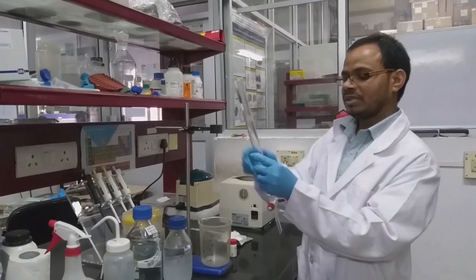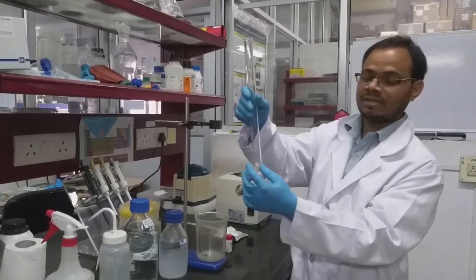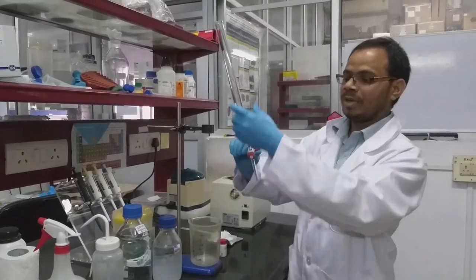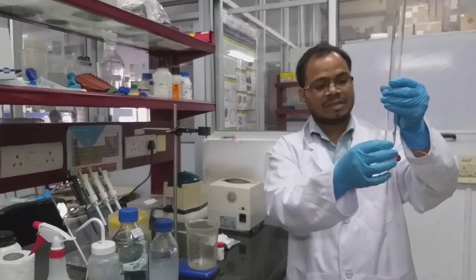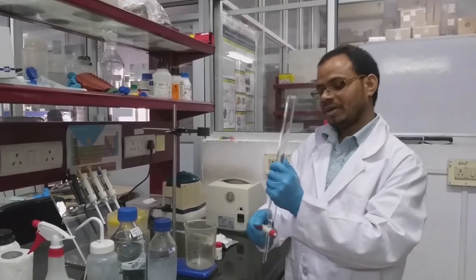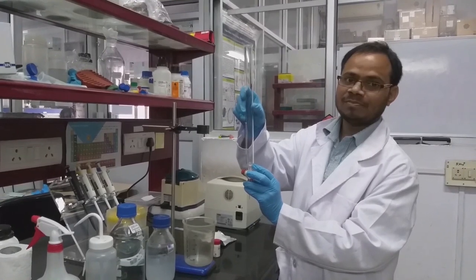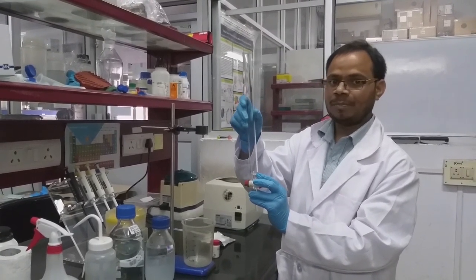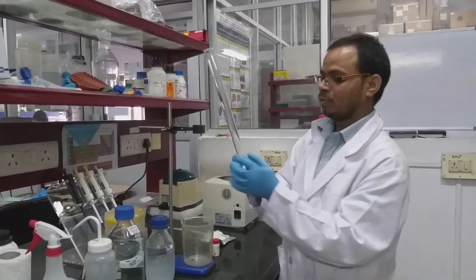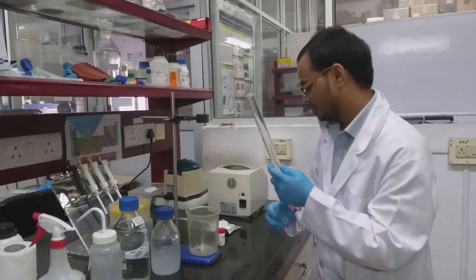Before using that, there is no support at the bottom of the column. So there is a direct contact. If you open this one, then completely whatever solution or beads are there will flow through. To prevent this, what we have to do is block this area with cotton, a small piece of clean cotton. So I am going to first put some cotton in the bottom of this one, then we will load the beads.